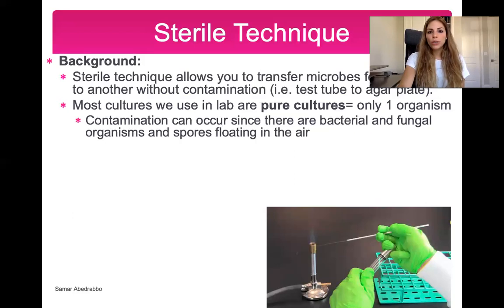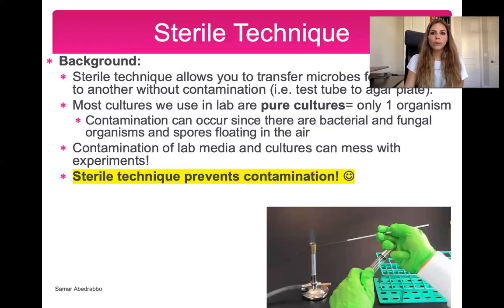Most cultures we use in lab are pure cultures. I want you to keep that in mind. Pure culture means it only contains one organism. So if we say that this is a pure E. coli culture, it means that there's only the E. coli bacteria in it. There's no H. pylori, there's no salmonella, there's no other bacteria. Mixed culture means that there's a lot of different bacteria.